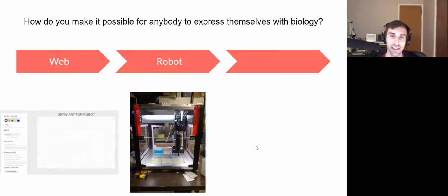The web stuff is all Python and Flask, which is pretty accessible and all free, of course. And then the hardware we're using is the Opentrons. We're not married to the Opentrons, but it is a good, solid, mostly open source system, so that's why we like it. And as far as strains, we want to try to use everything in OpenMTA. There's a great culture of sharing strains freely under OpenMTA, so the idea is to keep those things accessible. This should be something that anyone can pick up for not that much money.